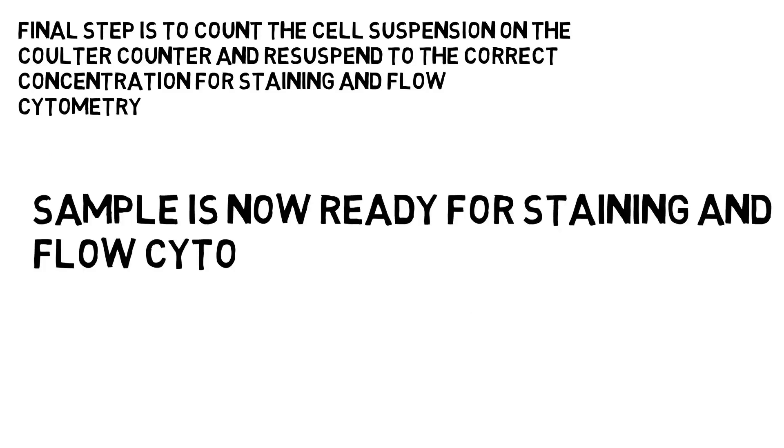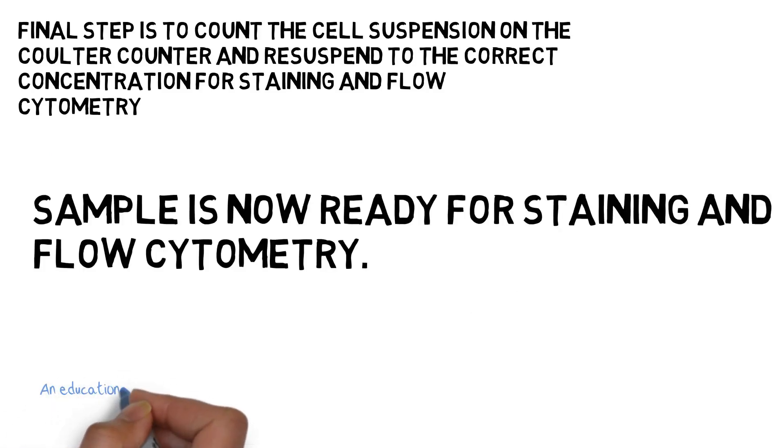Finally, you should count the cell suspension on a Calder counter and obtain a cell count number for that suspension. The sample is now ready for staining and flow cytometry.